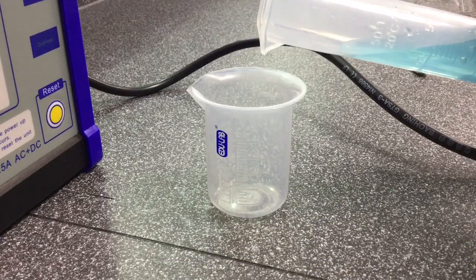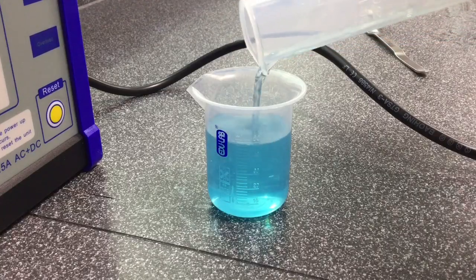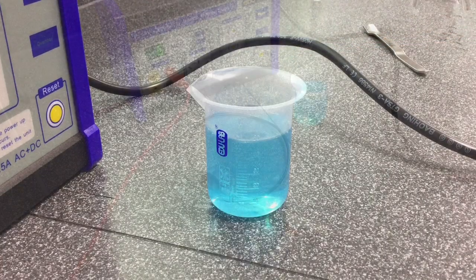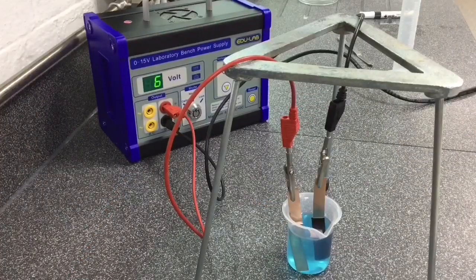We then measure 50 centimeters cubed of the copper sulfate solution into a small beaker. Using the copper electrodes we set up a simple circuit set to six volts.